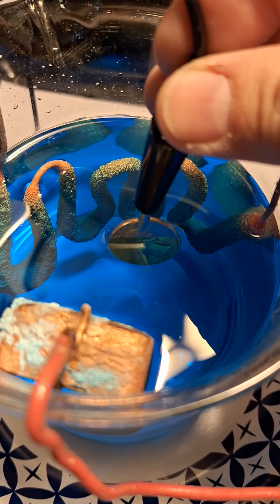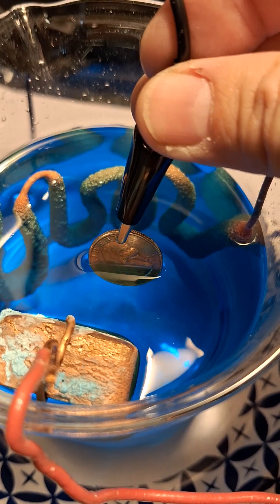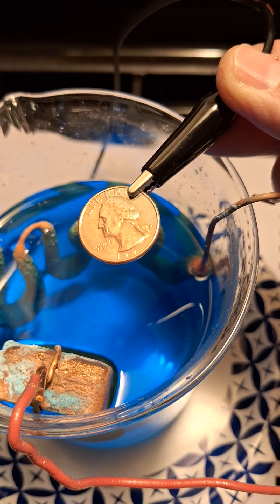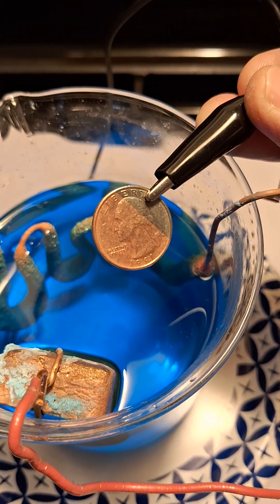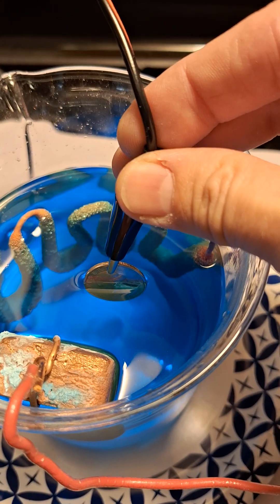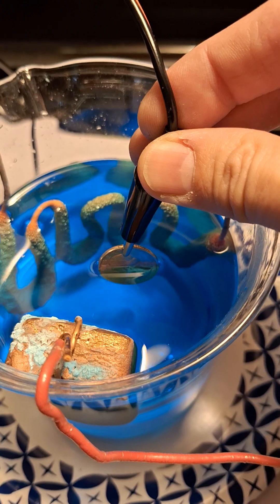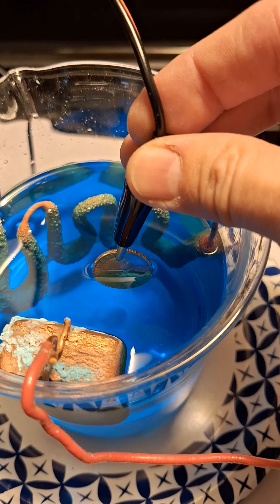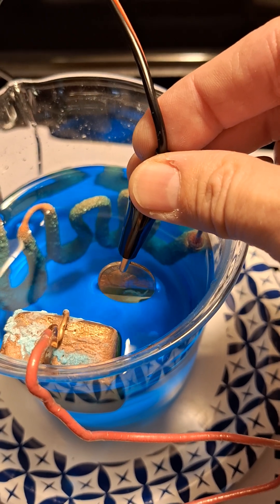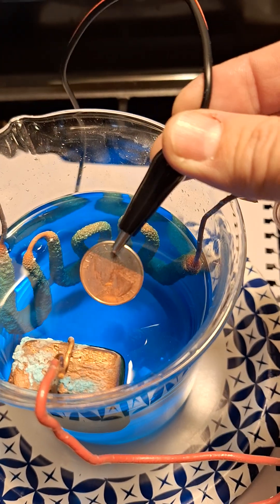You can see we're getting copper plated onto the quarter. With a paper towel, I will carefully move the clip to the other side to complete the plating process so that it will cover the entire quarter.